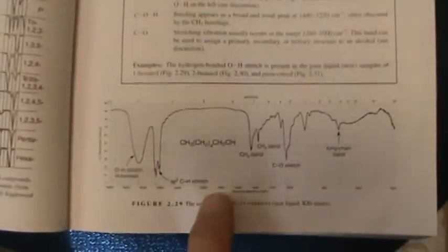If you look up in the alcohol section, you can see the black box, you can see some representative spectra where they label it for you. There's one reference, there's 2 more. The more important part though, I think by now most of us know that this big OH stretch peak means hydrogen bonded because it's very broad. If you go to the NIST website and look at a gas phase, all it means is you don't have as much hydrogen bonding. In a gas phase, this peak would be a sharp spike. You can see that easily on NIST.